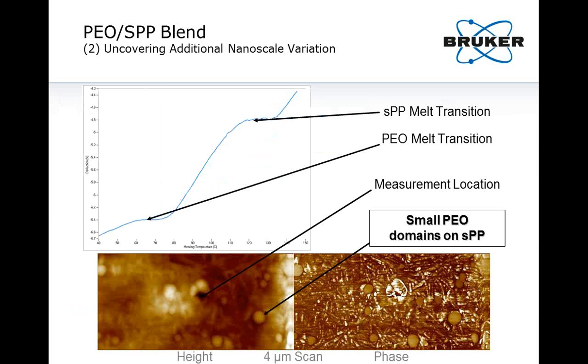Now, the previous image was a large AFM image. Zooming in a bit further, looking more at the fine structure, though, we notice more detail that we didn't notice at first. In the matrix, we see that typical fibrillar structure that you might expect for polypropylene, but also a lot of small droplets all over the matrix that already look a bit foreign to this sort of material.